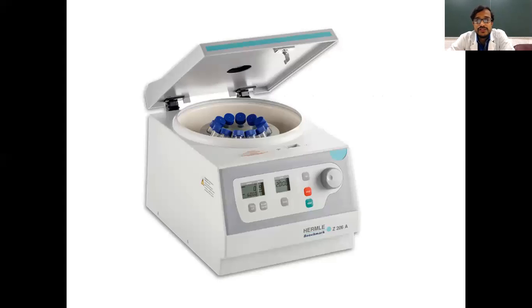So this is the centrifuge. Here you can see the wells in which the test tubes are placed, and after that it is rotated at a specific RPM, mostly 2000 to 3000 RPM, at which the serum will get separated from the blood cells. And this serum is sent for the analysis.